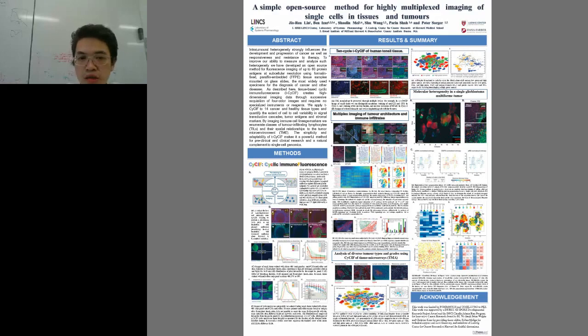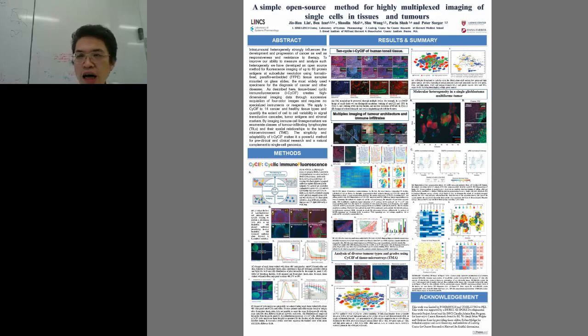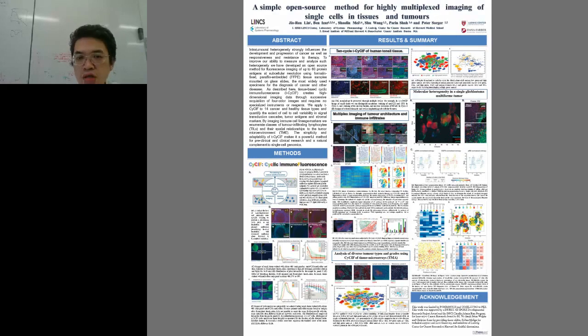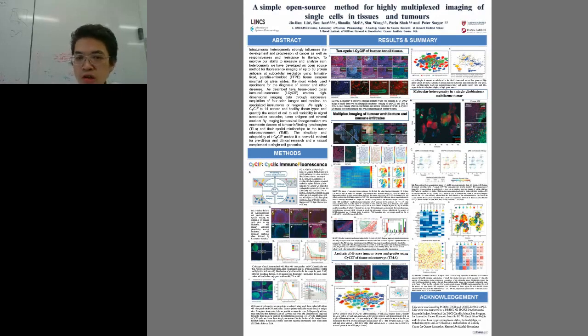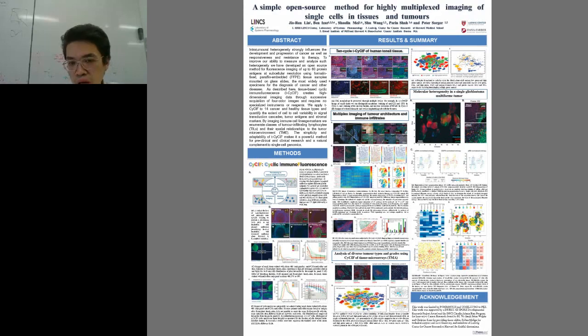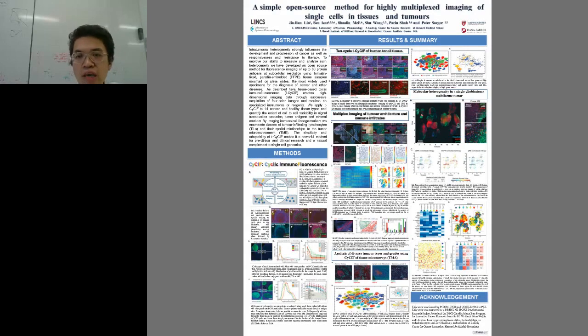One interesting application for this kind of method definitely is on the immuno-oncology side. You can try to start to differentiate. In this case, we have a renal cell carcinoma here. We can differentiate tumor versus the stroma or the immune cells very clearly. Now we can quantify all these cells in different compartments in a relatively easy way.